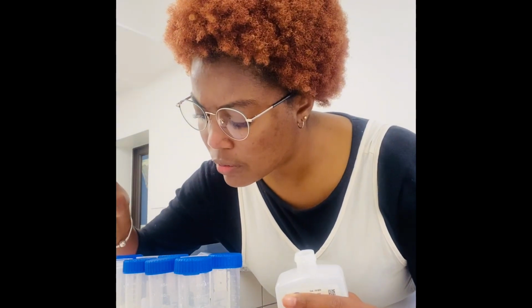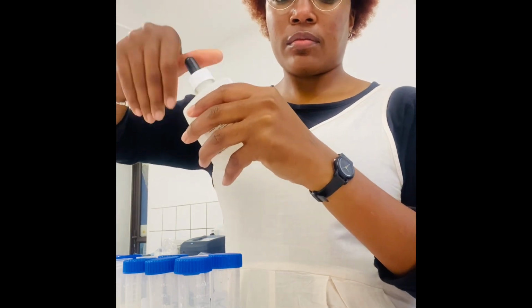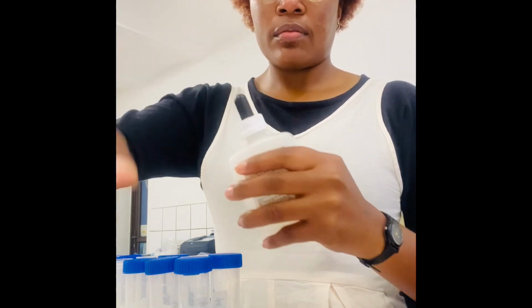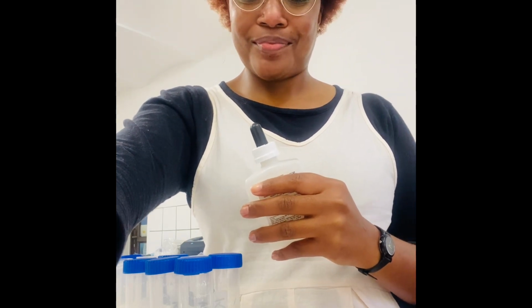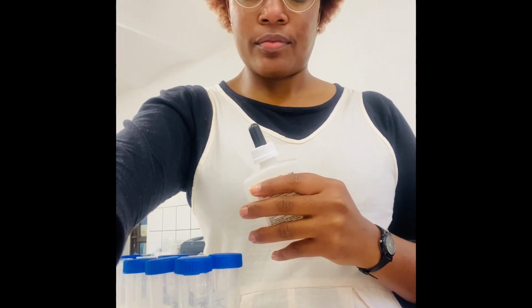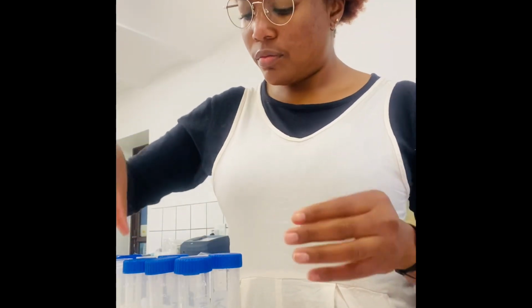So with the nutrients, they all have timers according to their own reagents. You put the reagents in the different samples, and then you wait for whatever time is allocated to that, and then you analyze and see what you have.